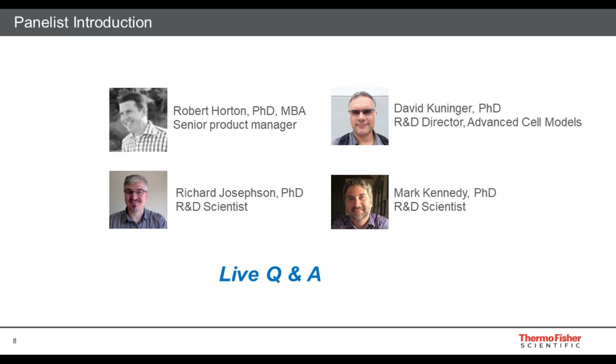Okay. Good. And then we also have a question about where we obtain our cells for 3D culture. Do we frequently source from patient biopsies, or where could one go to get cells? Yeah, so I guess I can add a little bit here. There are a number of different sources that one can go to for cells for different types of 3D models. There are a number of different cancer cell lines, sort of the workhorses in many labs.